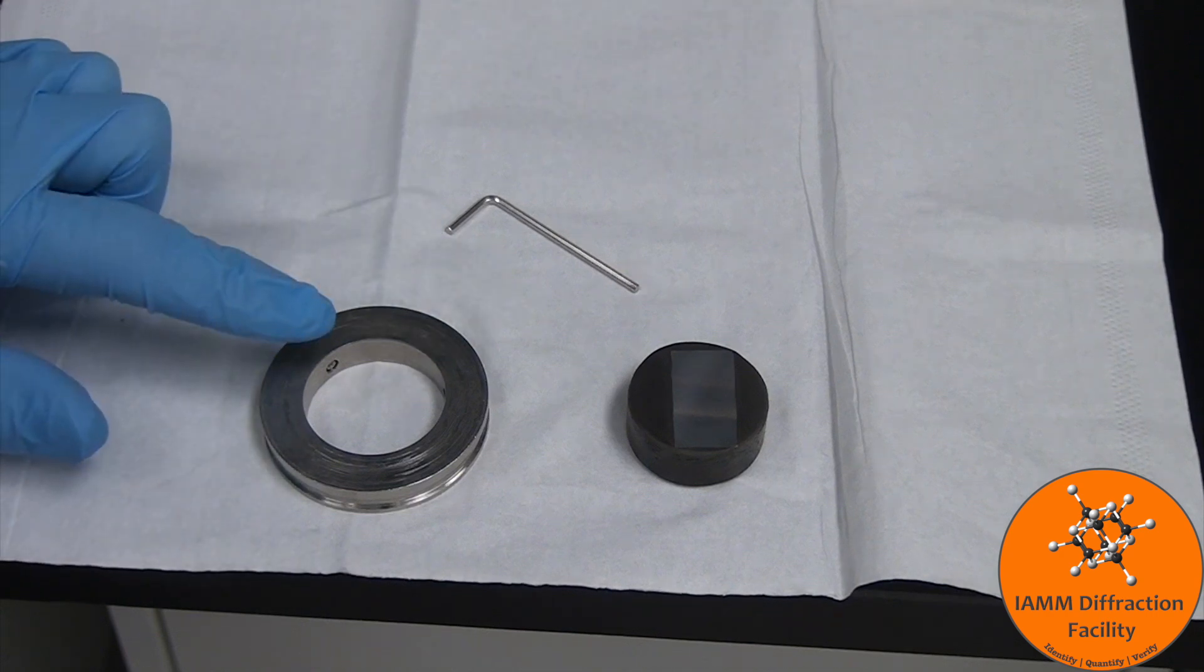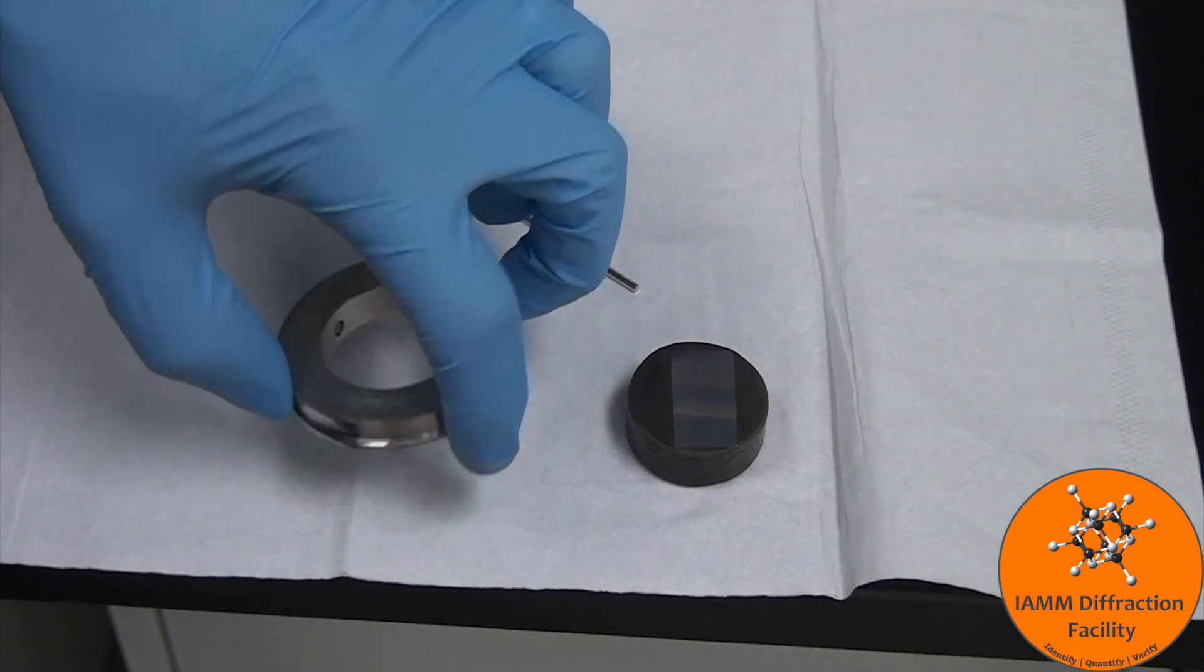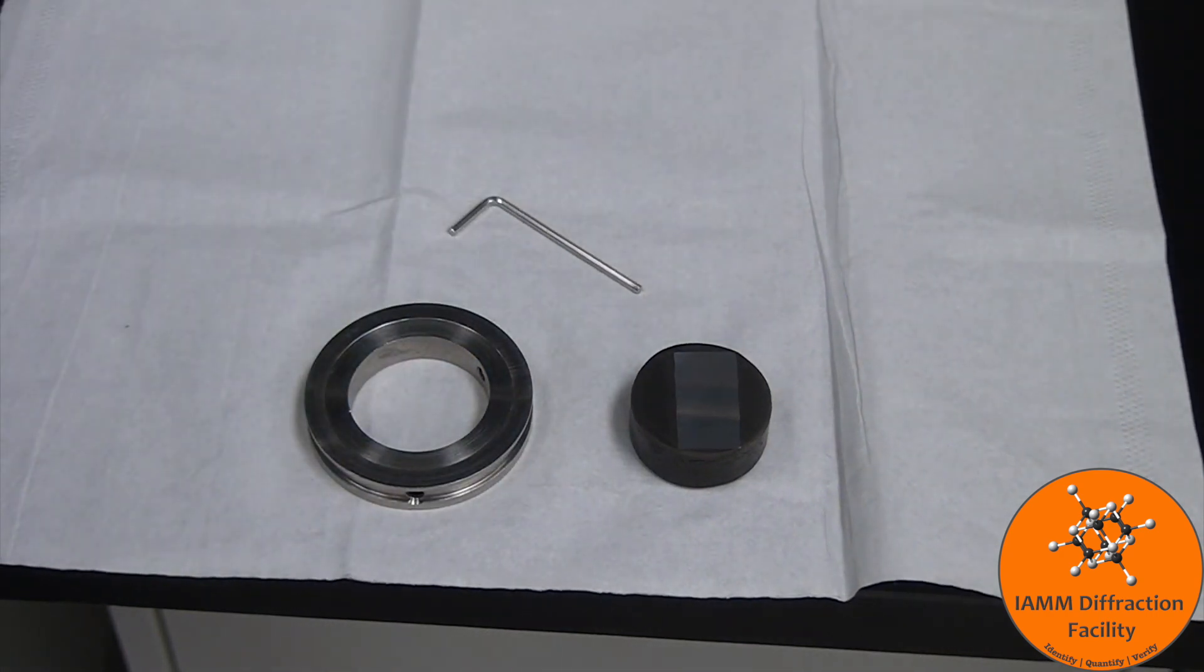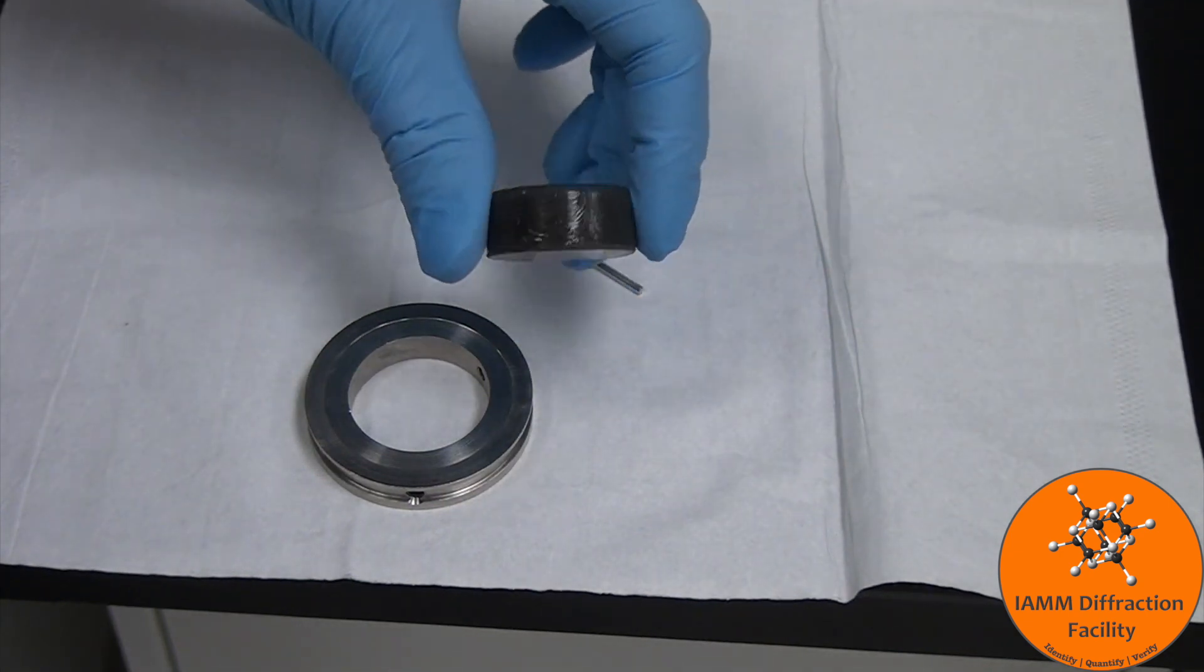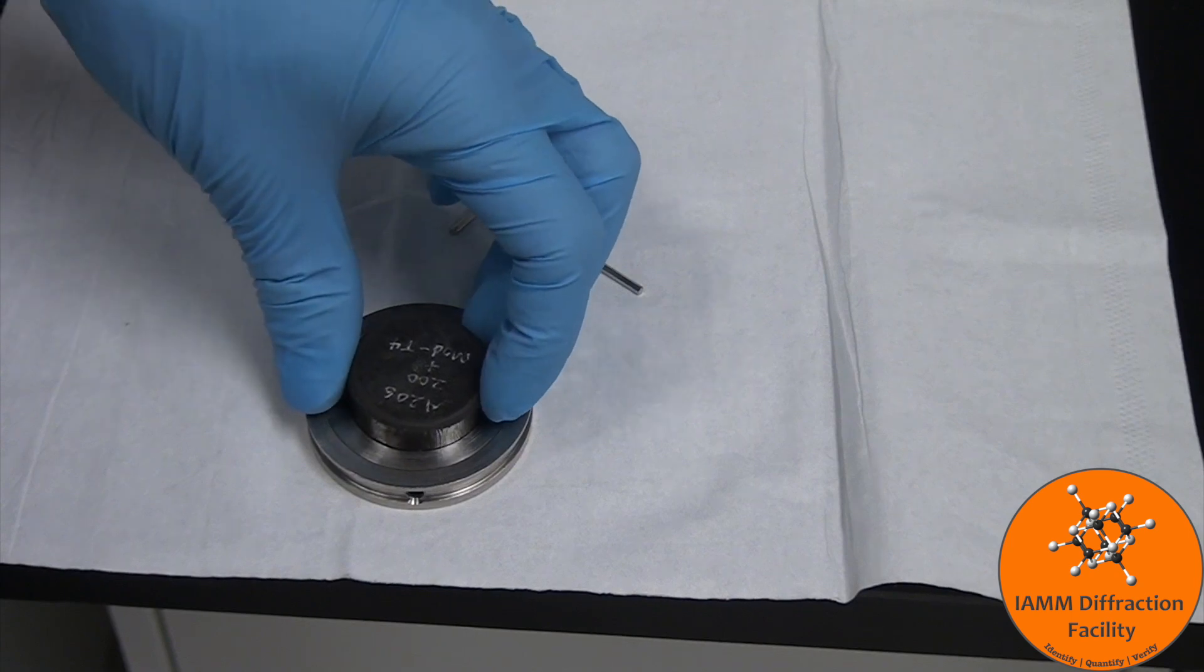Once you know the upright position, you want to flip it over. I will mention that I like to put down a chem wipe first to protect the surface of my sample. Because I'm going to take my sample, flip it over, and place it into the sample holder.